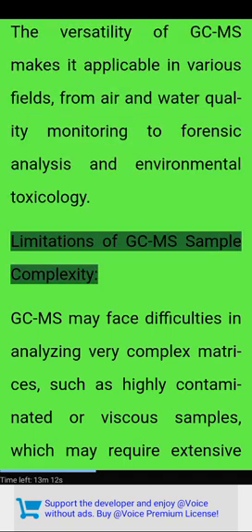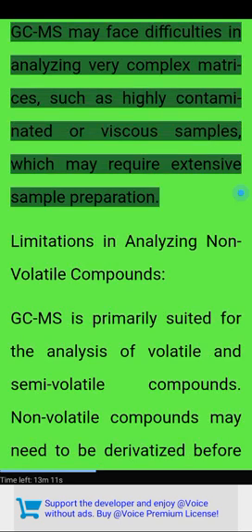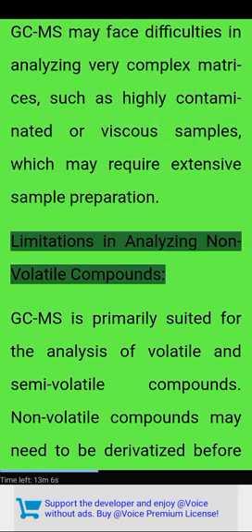The versatility of GCMS makes it applicable in various fields, from air and water quality monitoring to forensic analysis and environmental toxicology. Limitations of GCMS: sample complexity. GCMS may face difficulties in analyzing very complex matrices, such as highly contaminated or viscous samples, which may require extensive sample preparation.